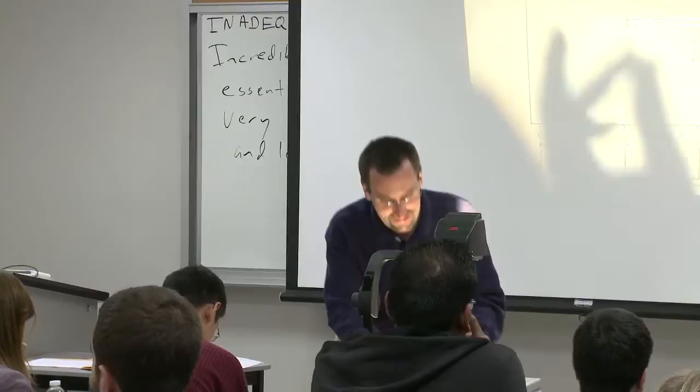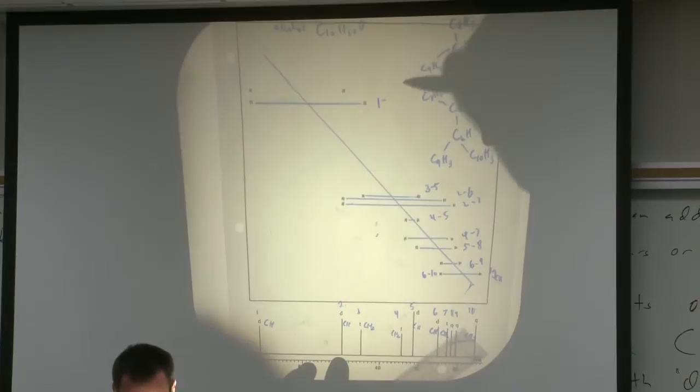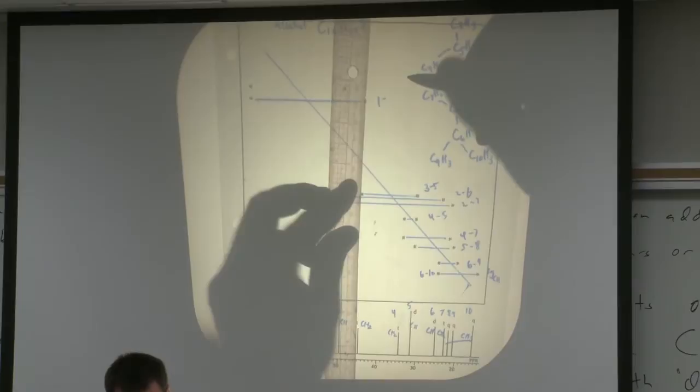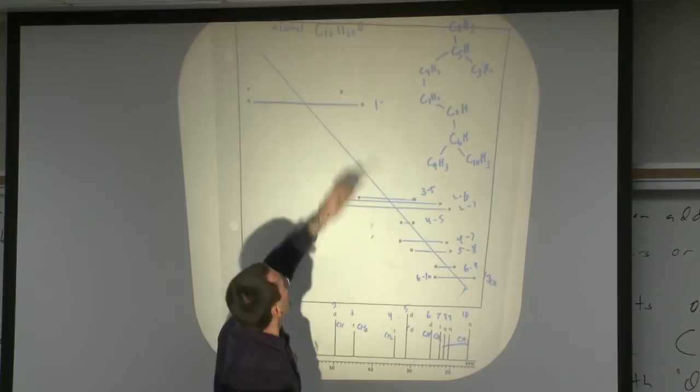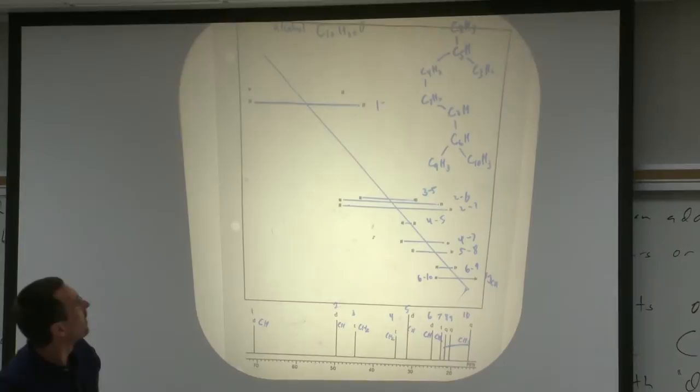All right, so let's see, where are we going here? Okay, so we've got, that looks like 1 to 3. It doesn't look center to center, the three is kind of elevated from the one. What's that? The carbon three. It doesn't go straight, does that matter? Does it, you mean I haven't drawn a straight line here? No, because when I draw it, is it? Yeah. Let's take a look here.